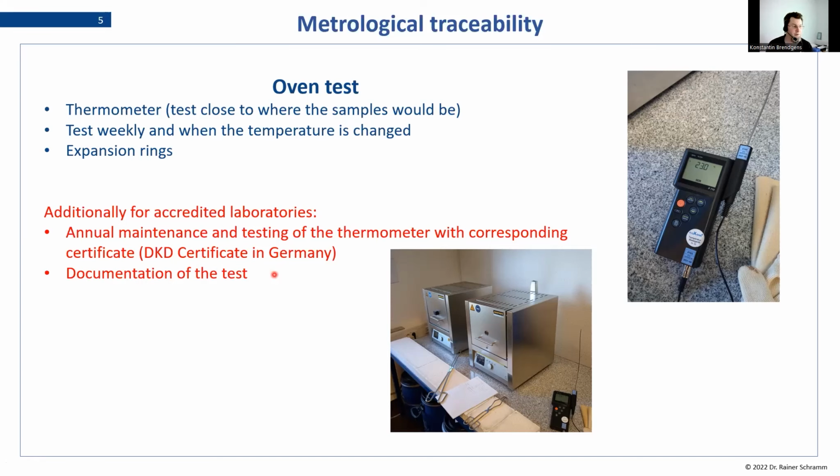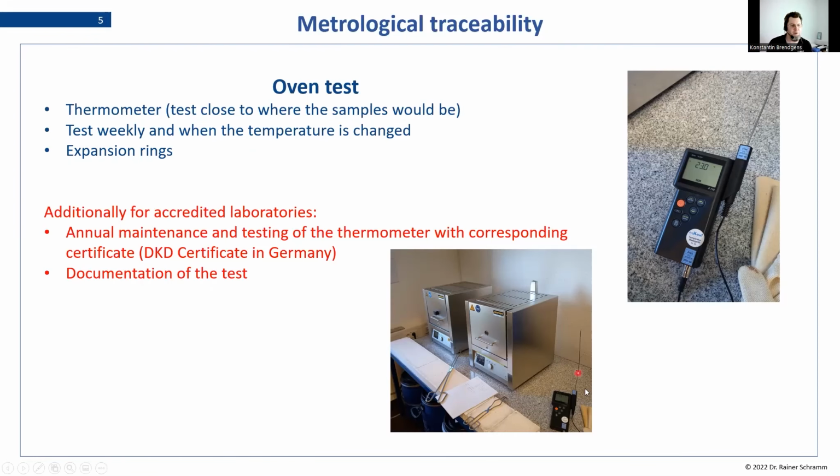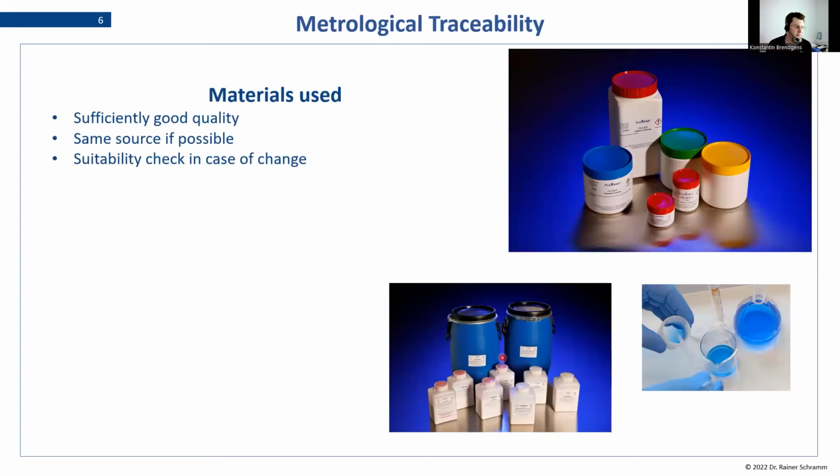And also, at some point you will see later on, I think, in one of the later pages, what this means, for example, is that your actual temperature, the one you want to use for your application, might vary from what is displayed, because this is the real temperature. So if this says 940 or 945, and this one says it's 950, then we'll just set it up that way. And so each oven has a different target temperature, basically. But we have it protocoled, and we can prove that it actually has the temperature that you would use.